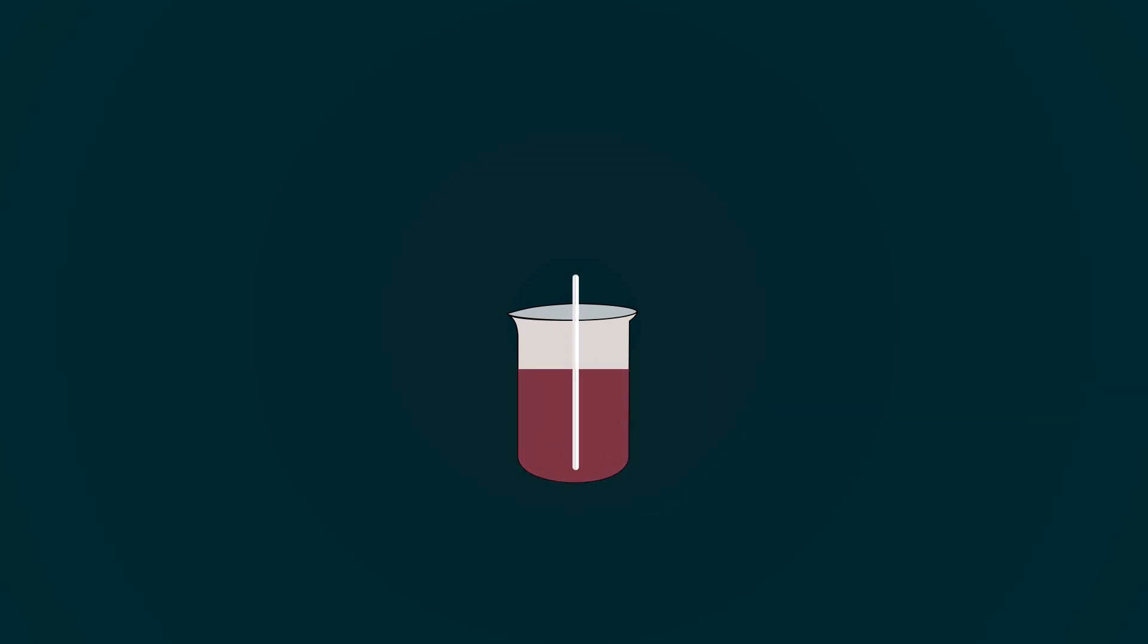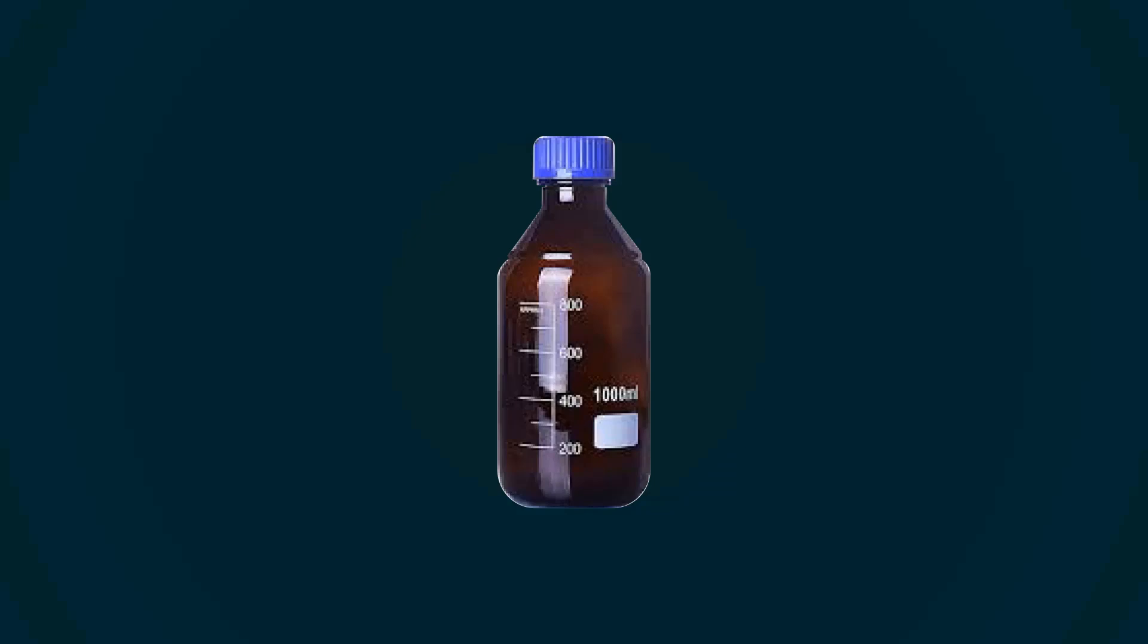Color will turn into dark red. We have successfully prepared Bromophenol Blue Indicator. We should store it in amber bottle.